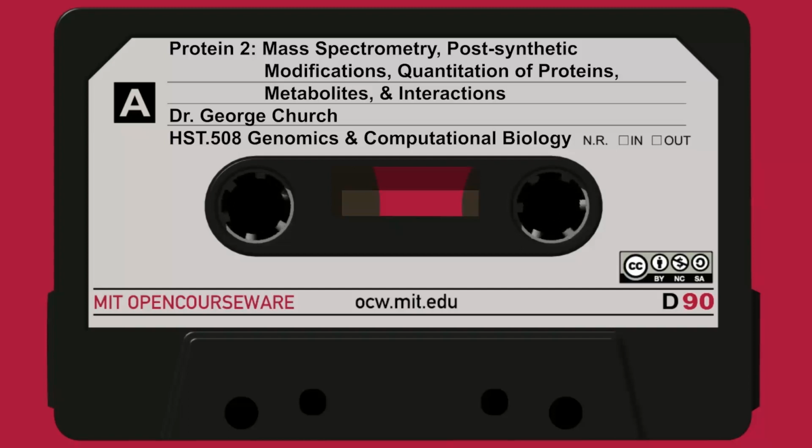Okay, so we've gone through calculating all these charge mass. Now we're going to do liquid chromatography, in particular hydrophobic measures. And this all falls under the heading of high-performance liquid chromatography, which is achieved under high pressure, typically, to get it to go rapidly. And so you'll digest your protein with trypsin. You get a series of these peptides, say 10 amino acids or so, and then they're injected in a liquid phase. They bind to the solid phase by the hydrophobic properties.